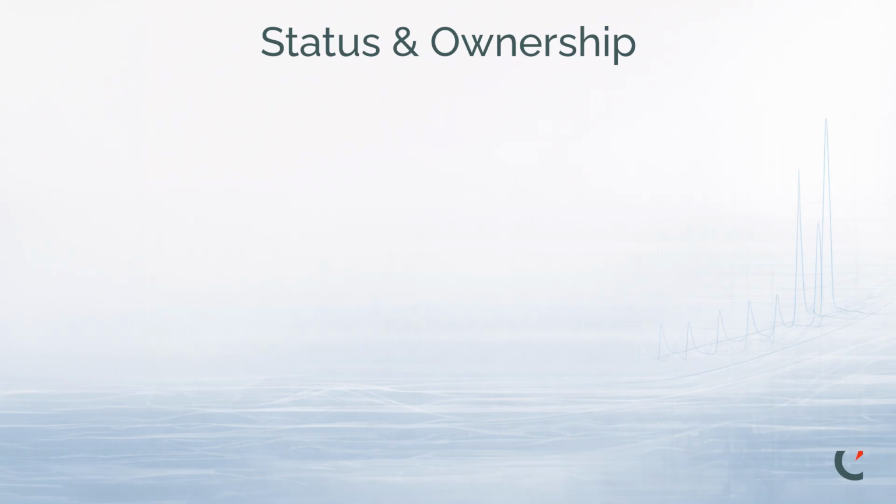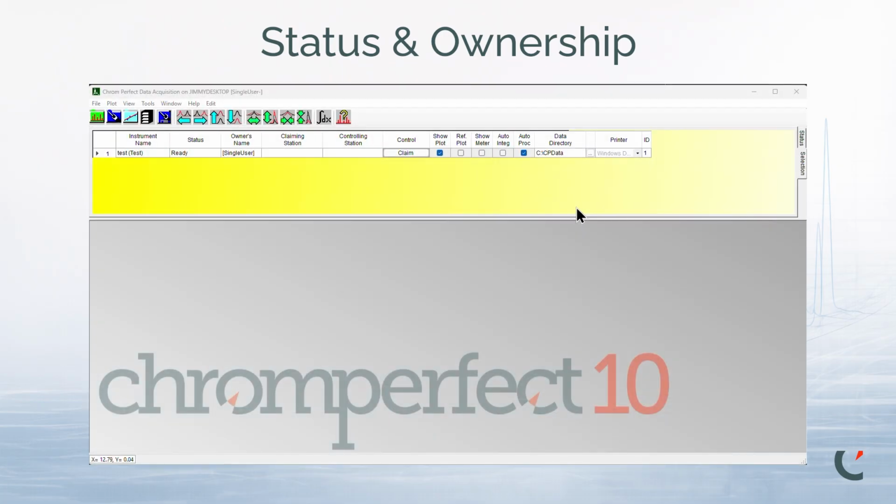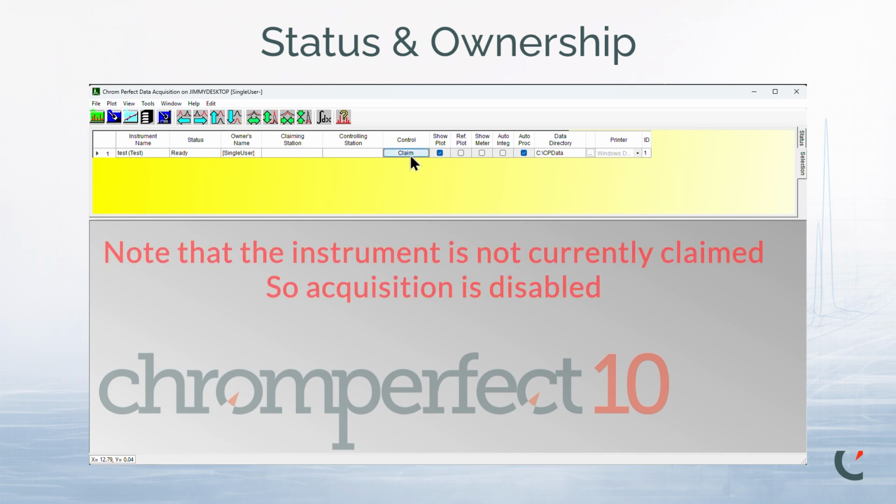Status and ownership. It is important not to confuse instrument status with instrument ownership. Before a method can be downloaded or a run started, the instrument must be claimed. For smaller or single-user systems, this is straightforward. An instrument must simply be claimed before it can be used.